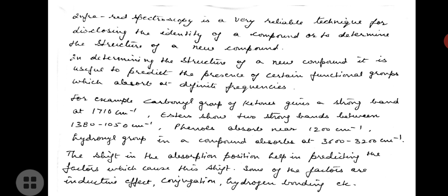And the shift in the absorption position helps in predicting the factors which cause this shift. Some of the factors are inductive effect, conjugation, hydrogen bonding, etc.